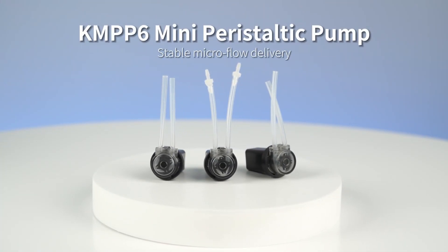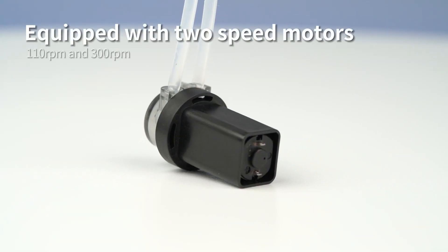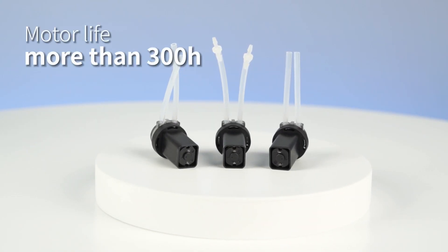KMPP-6 Mini Peristaltic Pump: compact size with only 14 grams, equipped with 2-speed motors, and a motor life of more than 300 hours.